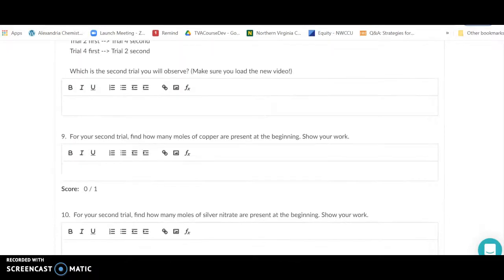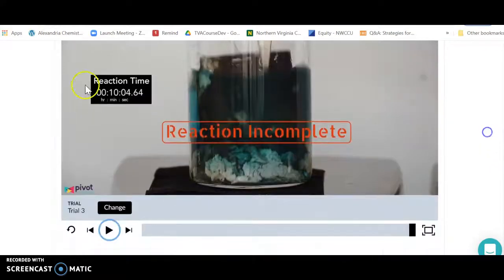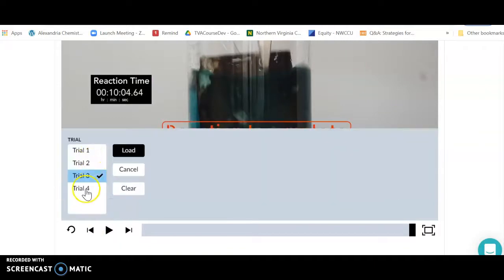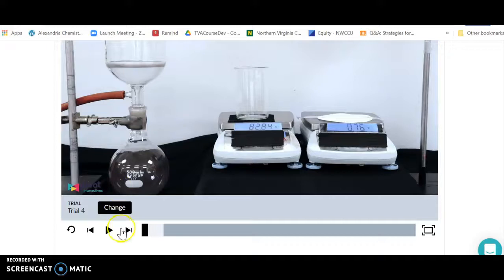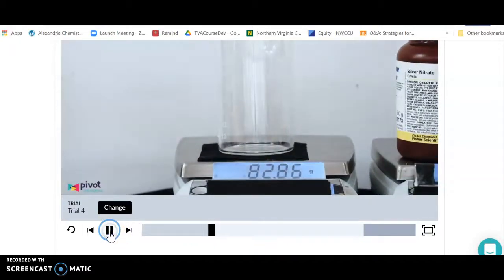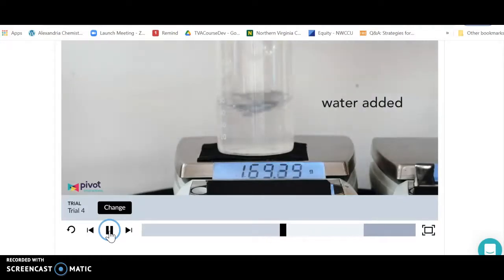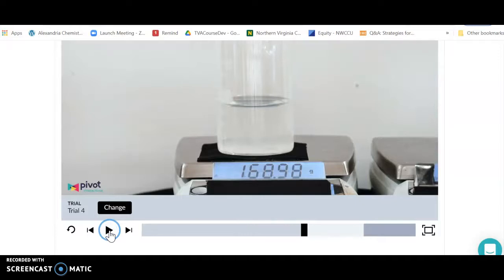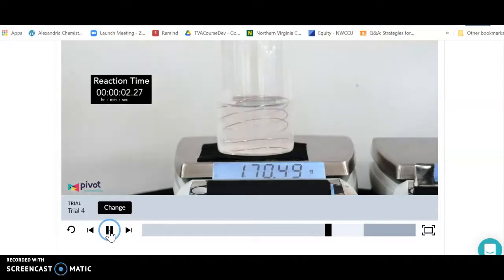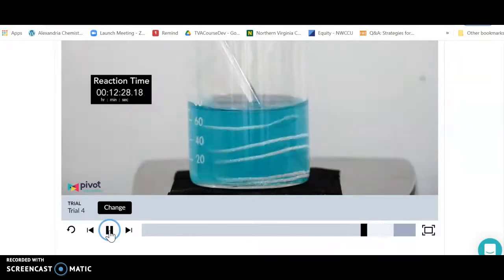Once you've done that, you're going to do a second trial with a different limiting reagent. Go back to the reaction video and pick a different trial — say trial four. Do the exact same process: record filter paper mass, beaker mass, add silver nitrate and subtract the beaker mass to get the silver nitrate mass, add water, and record that mass. Then put in the copper — subtract the mass of everything else on the balance to get the copper mass. Let the reaction occur.